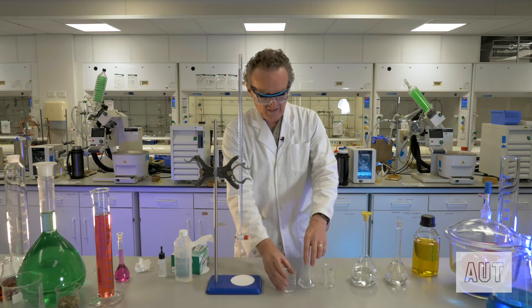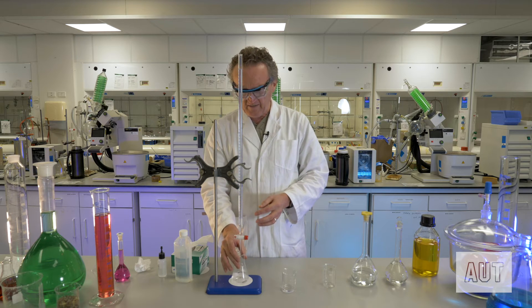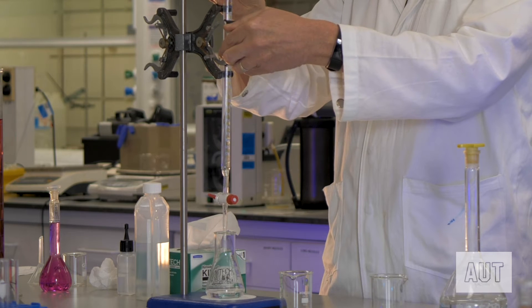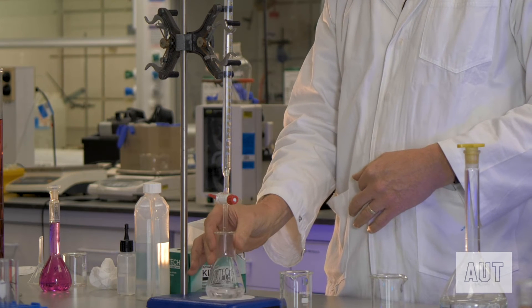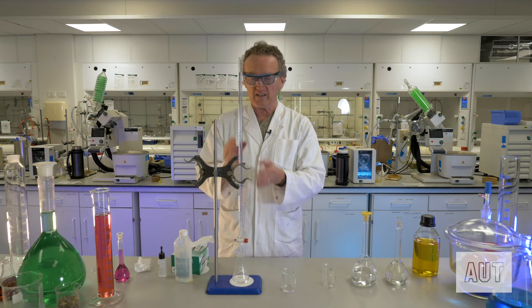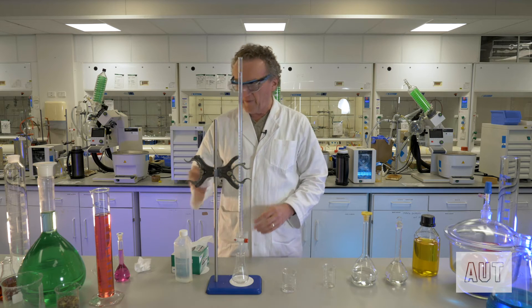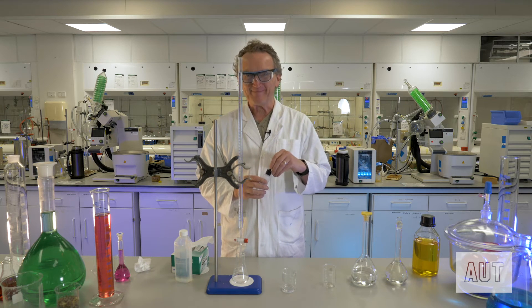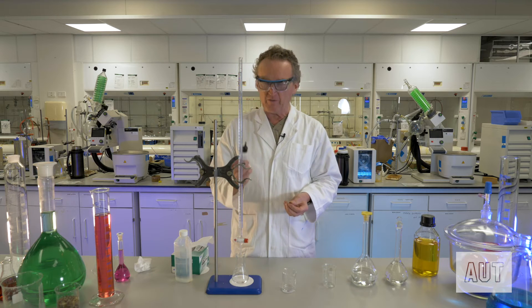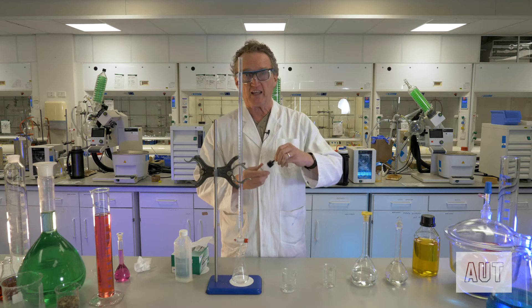Now we're all set. Here's our Erlenmeyer — we're going to put it under there like so. A good tip: you're going to be swirling the Erlenmeyer as you're adding the sodium hydroxide, so put the level of the burette tip below the top of the Erlenmeyer. That way as you're swirling you'll never miss the target. If the tip is too high, you can very easily drop solution outside the flask. The one thing we need to remember is to add our indicator — in this case phenolphthalein. All you need is a couple of drops; two drops will do. Don't put a huge squirt of indicator — more is definitely not better here.